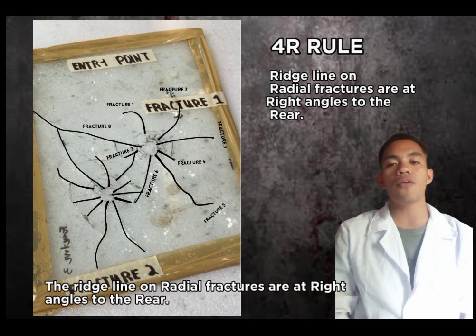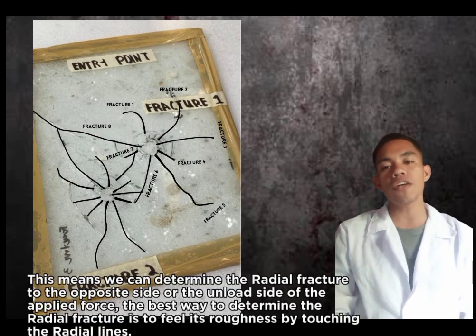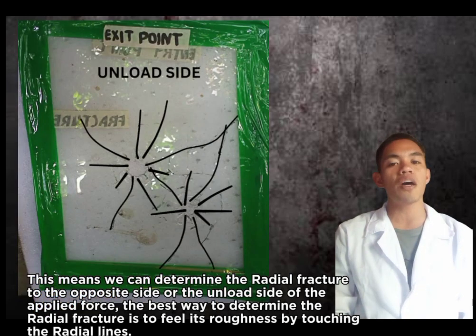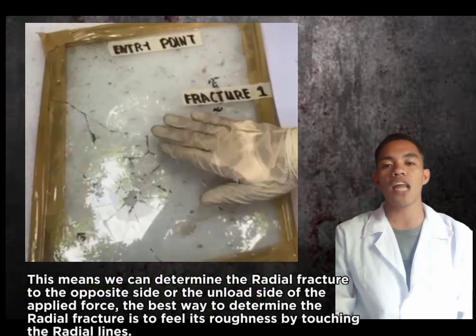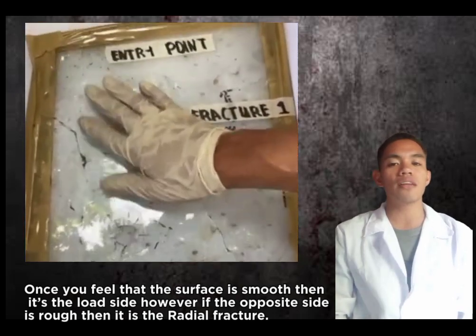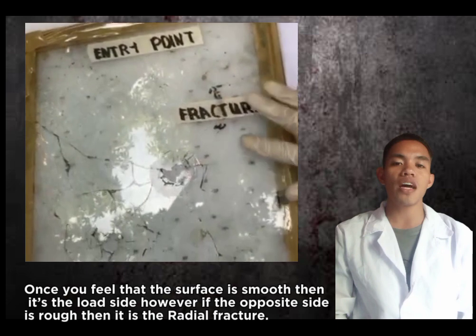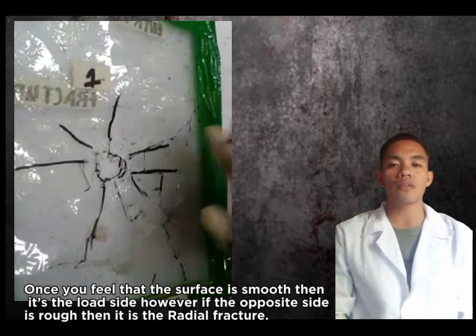The ridge lines on radial fractures are at right angles to the rear. This means we can determine the radial fracture on the opposite side, or the unload side, of the applied force. The best way to determine the radial fracture is to feel its roughness by touching the radial lines. Once you feel that the surface is smooth, then it's the load side. However, if the opposite side is rough, then it is the radial fracture at the exit point.